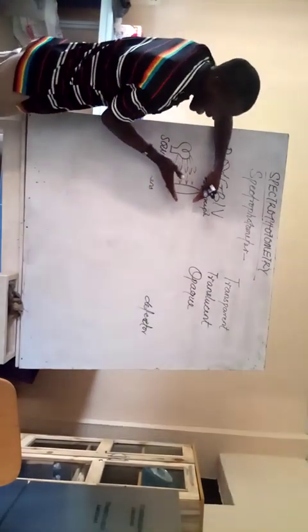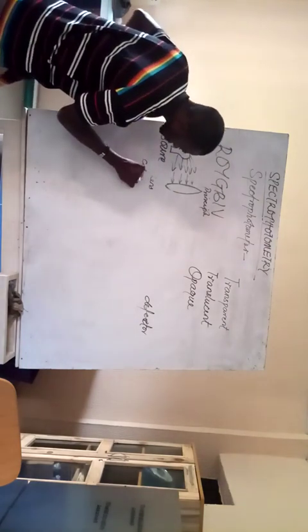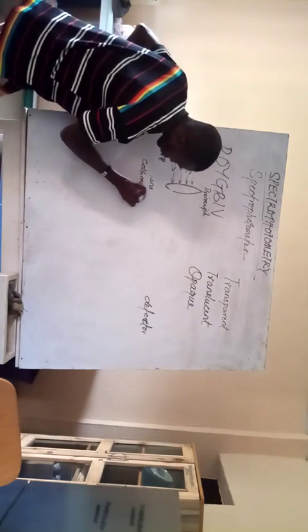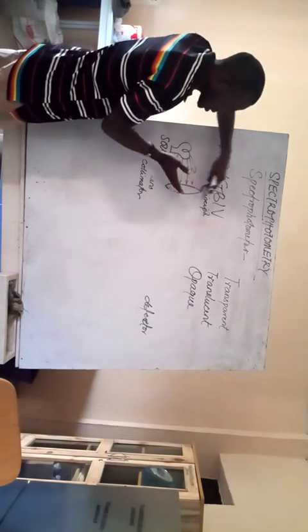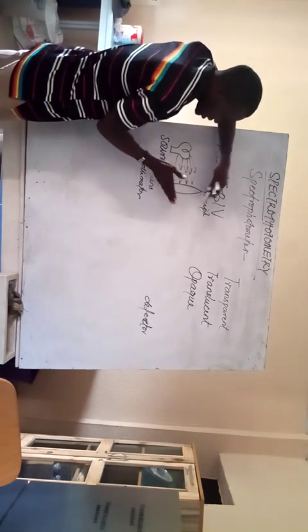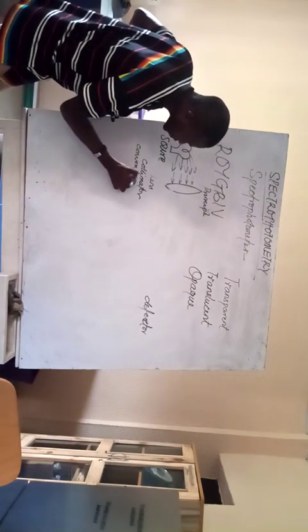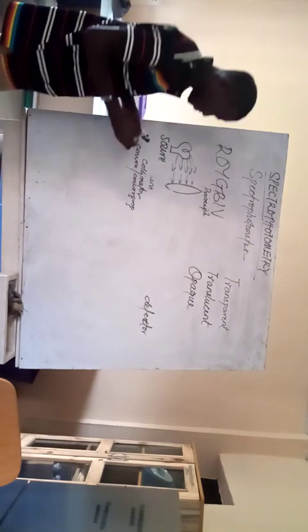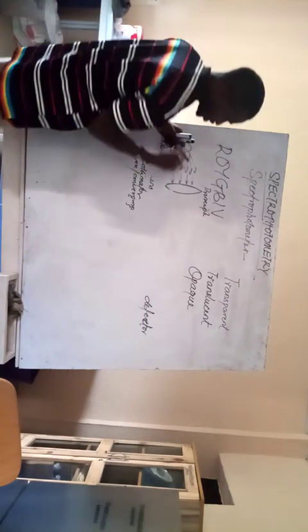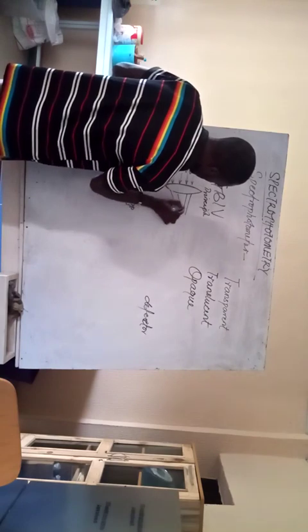This lens is also called a collimator, because that's what it basically does. It focuses the ray of light that is incident on it, and it is a convex or converging lens. Based on this name, you see it converges the ray of light that hits it.